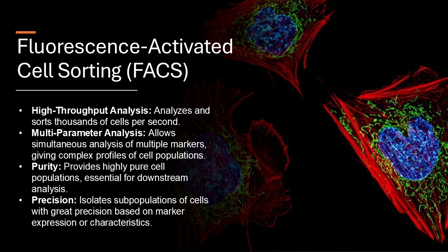It really is mind-boggling to think of the possibility. We've all heard of personalized medicine, right? I imagine FACS plays a role in that. Absolutely. One of the most impactful applications of FACS is immunophenotyping. Immunophenotyping. Yeah. It involves identifying and characterizing different types of immune cells.